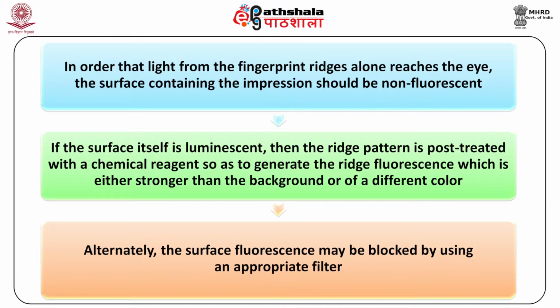In order that light from the fingerprint ridges alone reaches the eye, the surface containing the impression should be non-fluorescent. If the surface itself is luminescent, then the ridge pattern is post-treated with a chemical reagent so as to generate fluorescence, which is either stronger than the background or of a different color. Alternately, the surface fluorescence may be blocked by using an appropriate filter.